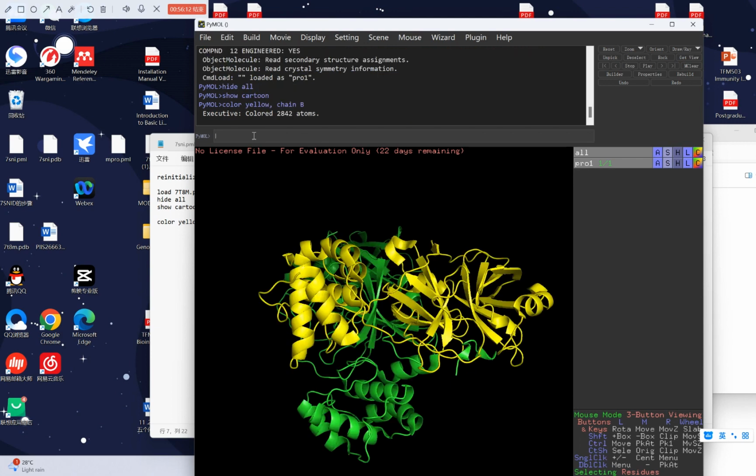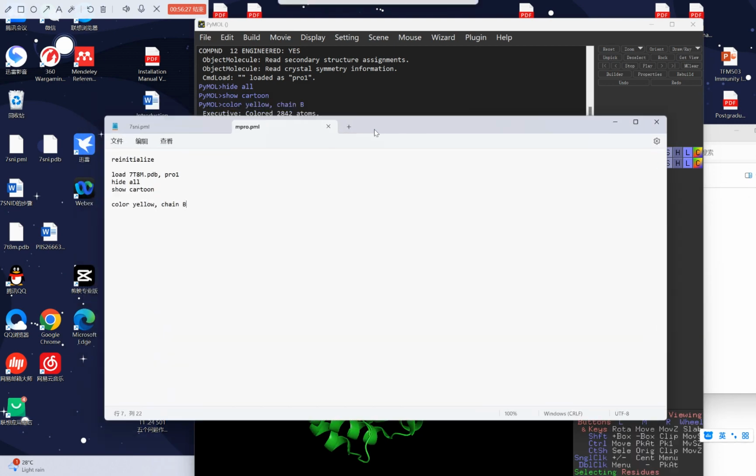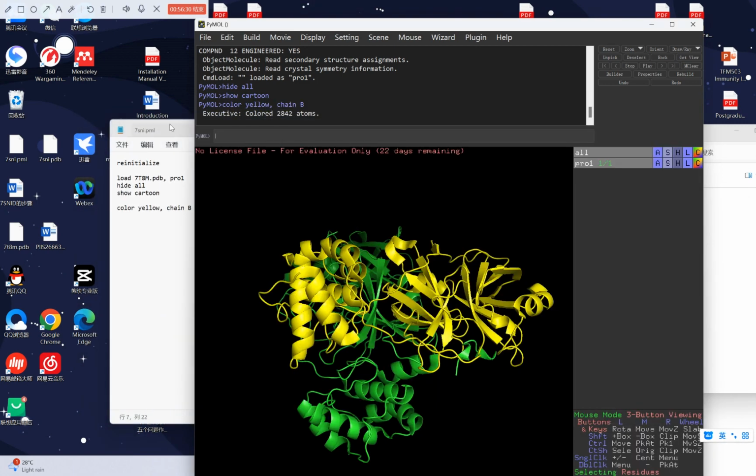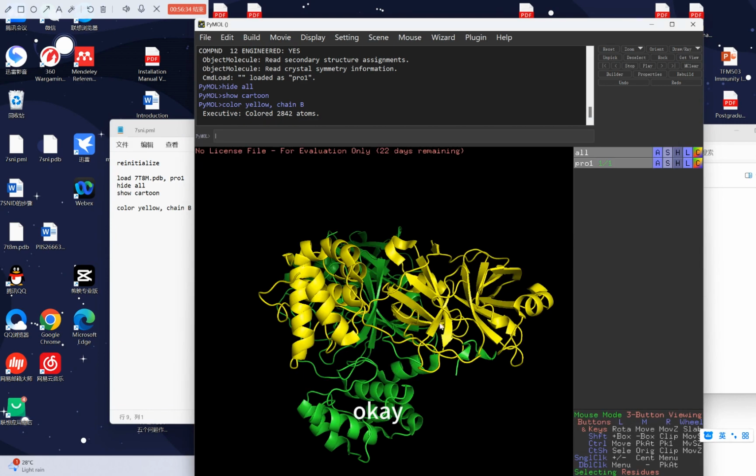I have a file with the O inside. It doesn't need to be opened, you can view it directly. I was trying to troubleshoot the whole thing and finally I found it. It's supposed to be the letter O, not zero. Okay. Wow, that is weird.